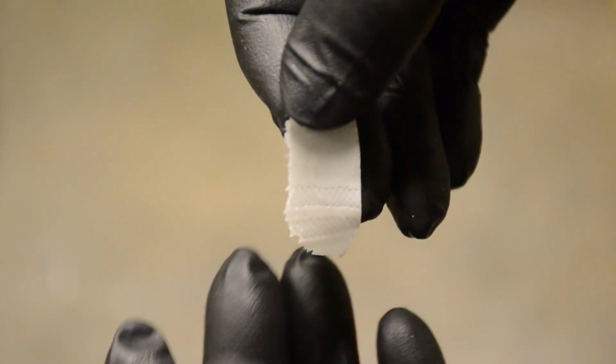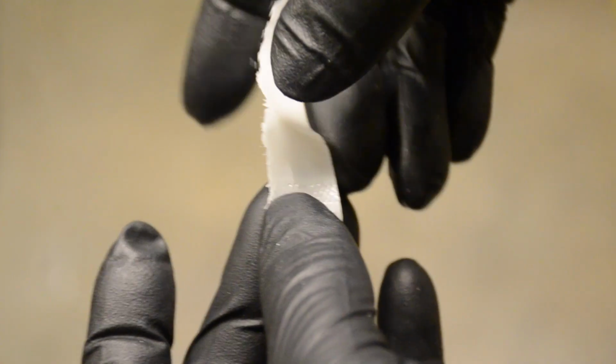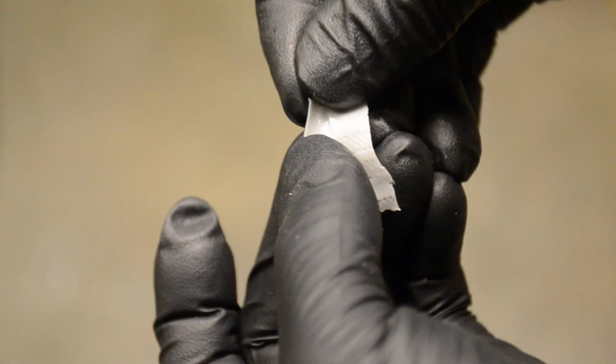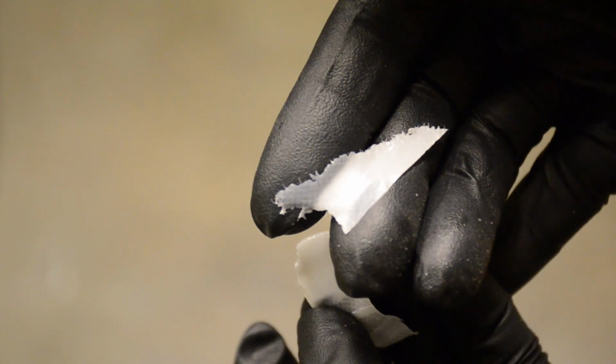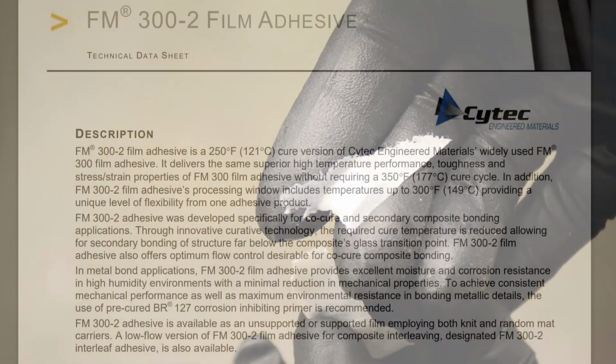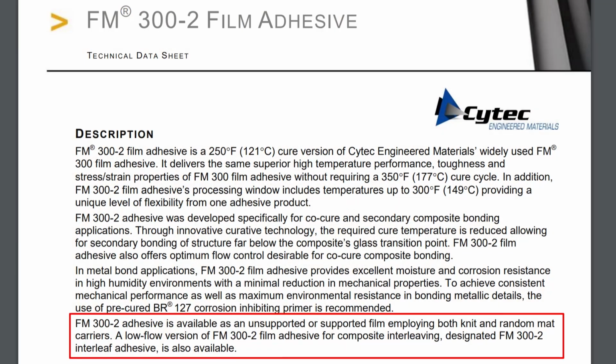Our adhesive film sample is supported, which means that it contains a very thin layer of fabric which provides some structural integrity to the film while it is being handled and placed. It is possible that this reinforcing fabric will affect the test result. Adhesive films are sometimes available with or without a supporting fabric, or may only be available in one form.